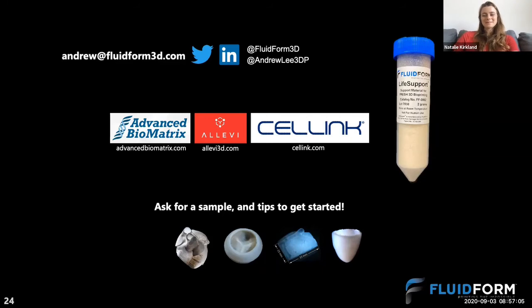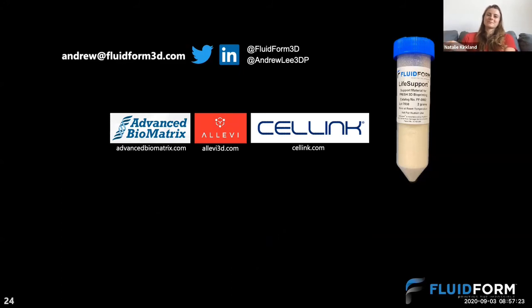That's a great talk. Whilst we wait for some of the questions to come in on the chat group, I was going to start with a basic one just for my understanding. I wondered, how are you getting from the print that's within the gelatin to then the structures you showed just a couple of slides before, the fully formed regions?